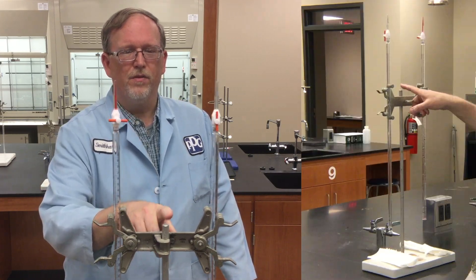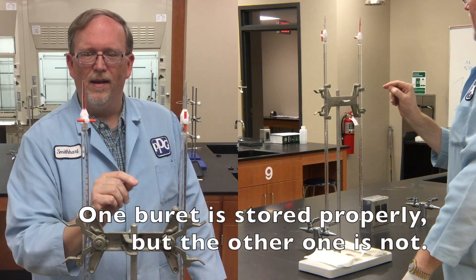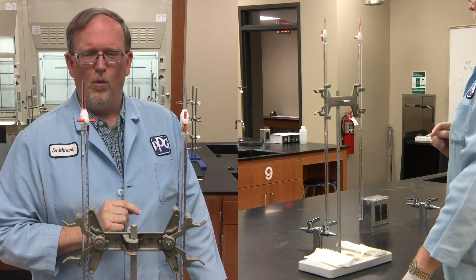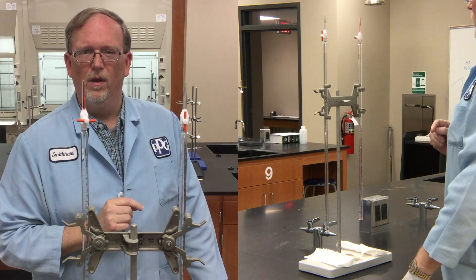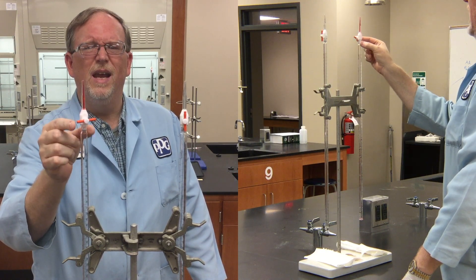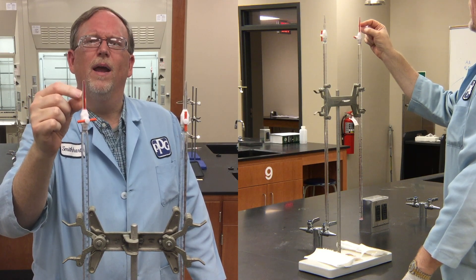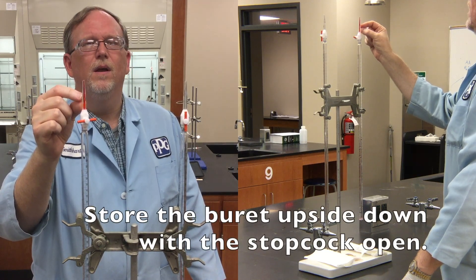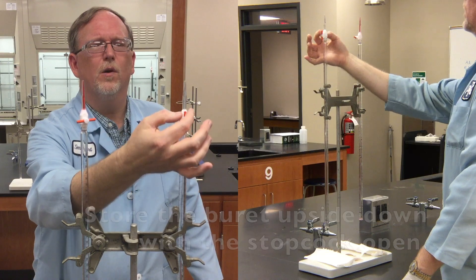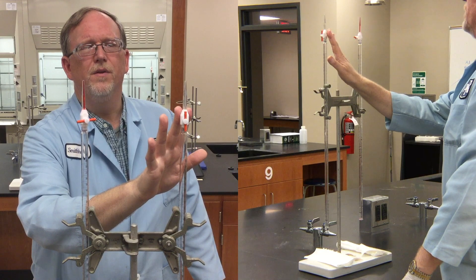Hello, chemistry fans. We're going to do a little burette work today. Here we have a burette stand with two burettes in it. One of them has been stored properly, and one of them has been stored improperly. The difference in these two burettes is the placement of the stopcock. This one is closed. The last liquid that was used in the burette is trapped in the tip. This one is open. Notice the vertical orientation of the valve. We want to leave it like this, not this.